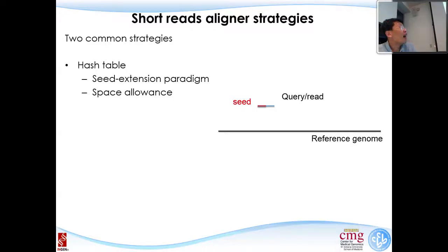How about if I only build 15 or 13 bases? That will still be manageable, right? And 4 to the power 13 is still manageable. Once I have that, and I get one particular sequence, I only check the top 13 bases. I first align these 13 bases, and then I have maybe a few dozen spots in the genome.